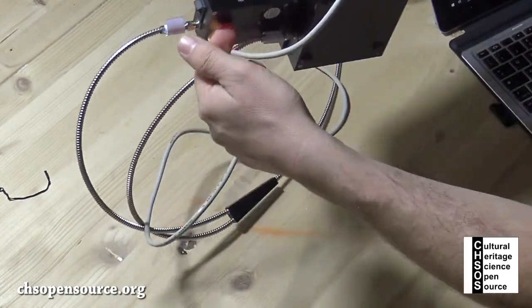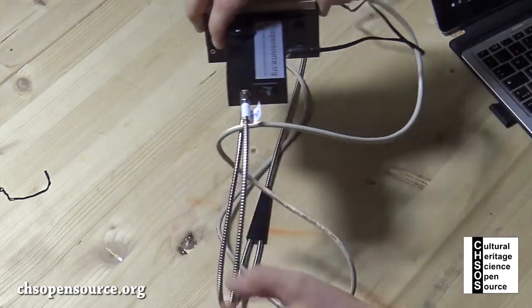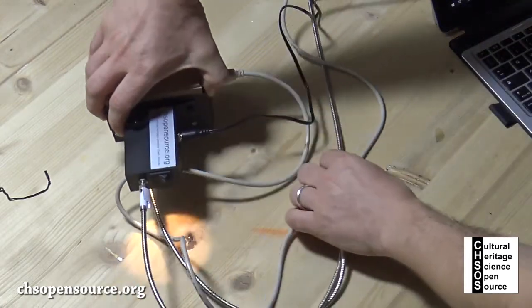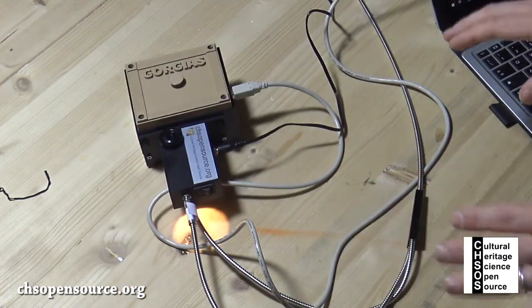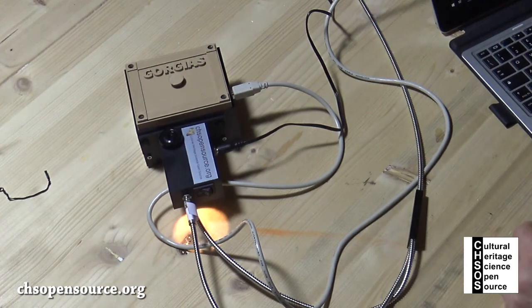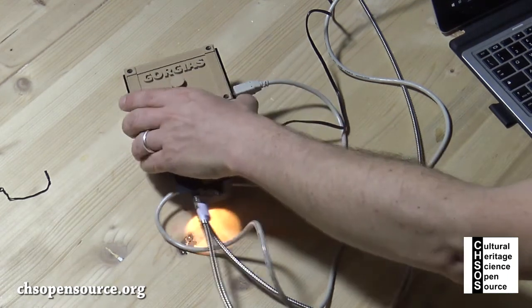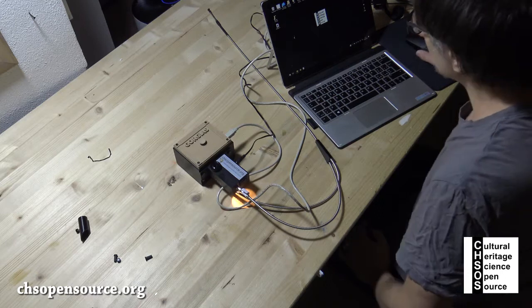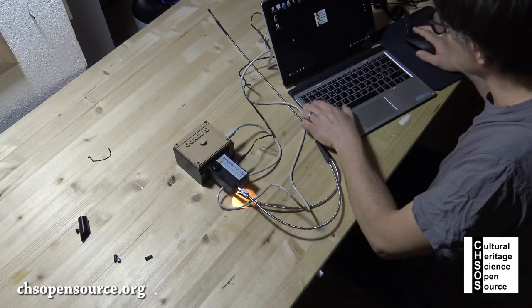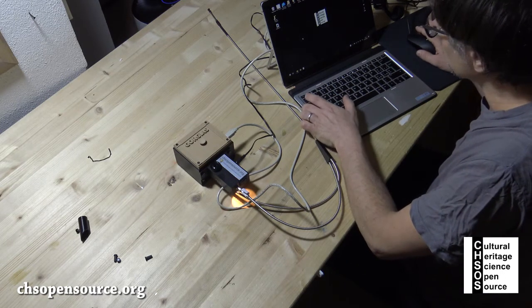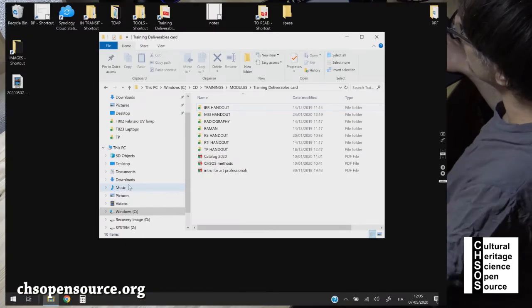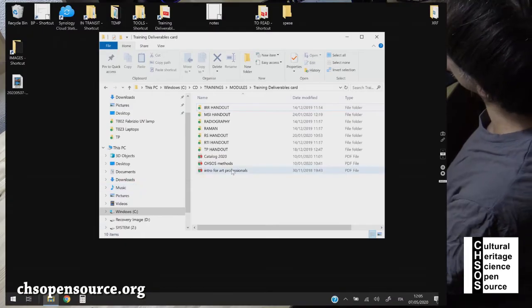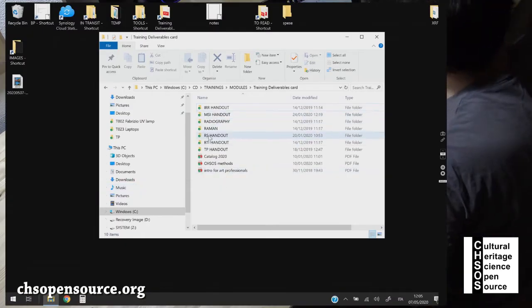The other one is labeled 'lamp'. So remove the cap and this one goes into the output of the lamp. Same thing, we put this one over here and this is it.